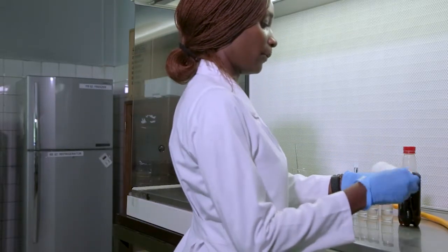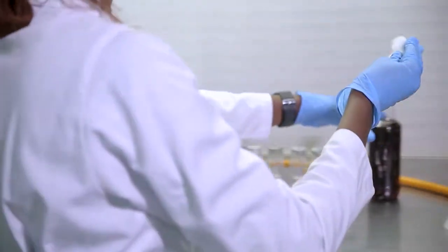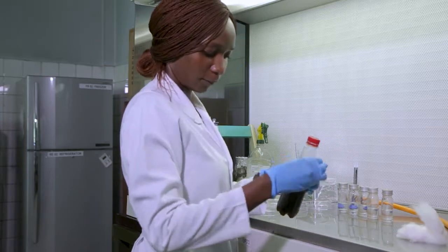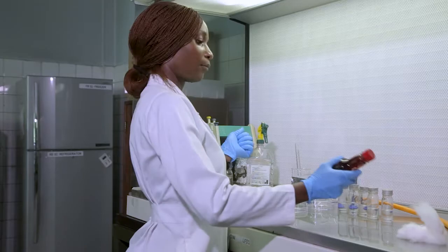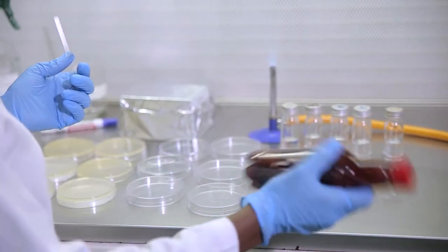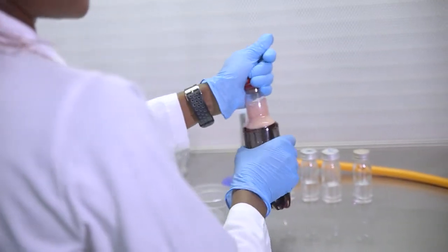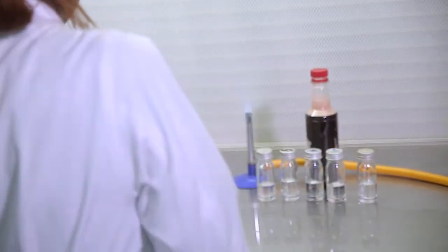So before you open the juice sample, you swab it also with the same disinfectant to make sure that we don't have any contamination coming from the outer part of the sample. So you shake this thoroughly to ensure that the sample is homogeneous. Okay? So I quickly pass it over the flame. And we also work very close to the flame to avoid any form of contamination.